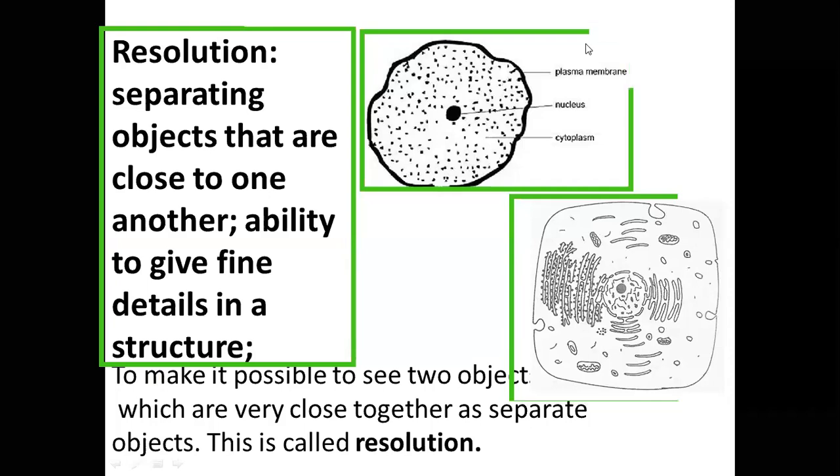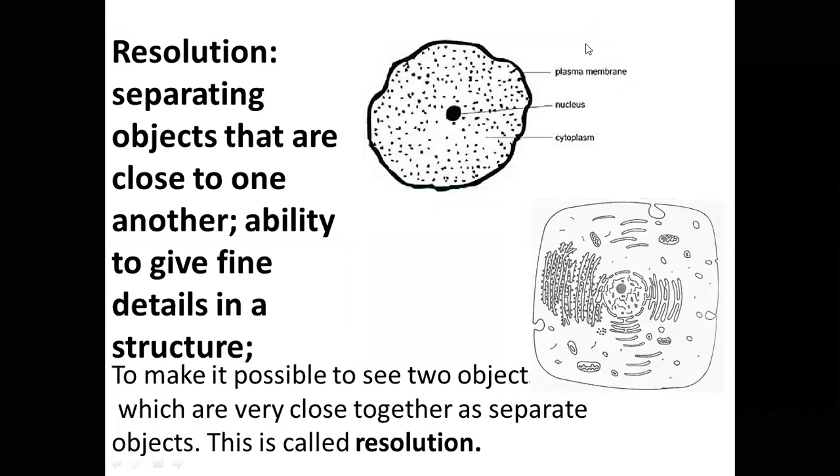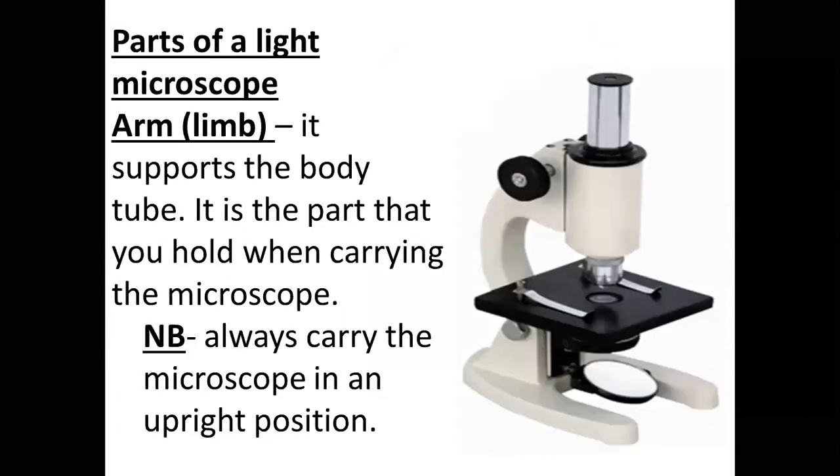Now, the microscope is the icon of the biologist. If you visit somebody's office and you find a microscope, you know that this is a biologist. So this is our tool of trade and we should understand it in depth. So, parts of a microscope, that's what I'm saying.